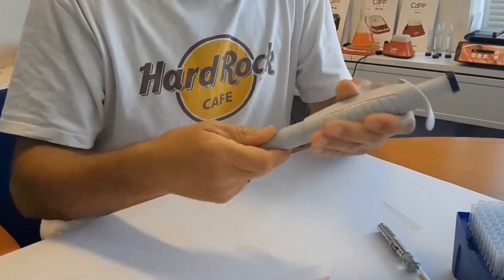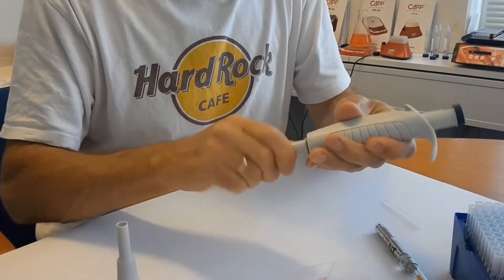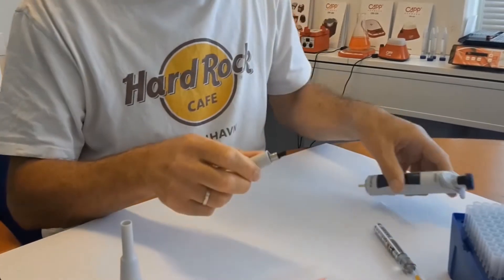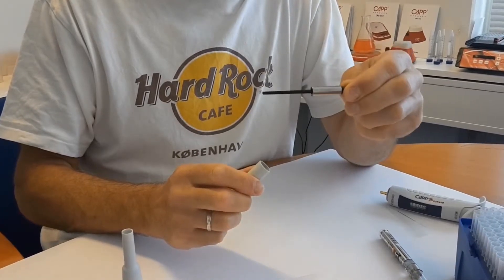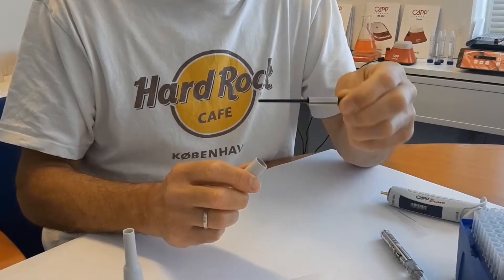Unscrew the tip assembly. You will now access the piston. Perform a visual check, ensuring that there is no sign of contamination or wear. Replace any worn or damaged parts.